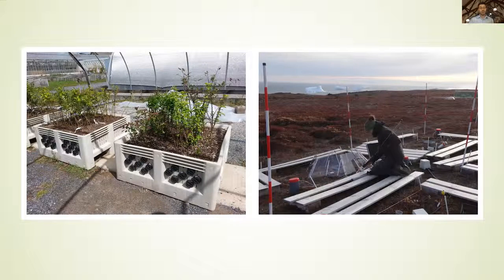On the right, just kind of showing some of its abilities to work pretty much regardless of the environment. You can see it there being worked at on the tundra. The 600 is doing scans there, and we found that it's actually the acrylic tubes that have more problems with the cold than the instrument itself in these studies.